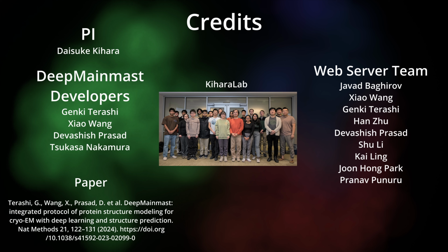For further, more detailed information, please look at our paper published in Nature Methods.